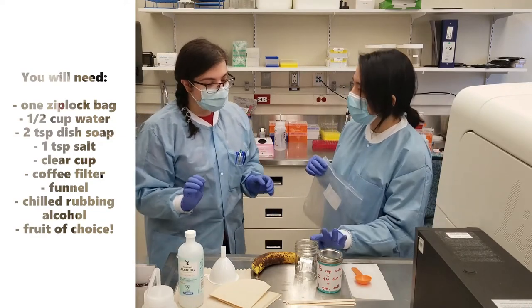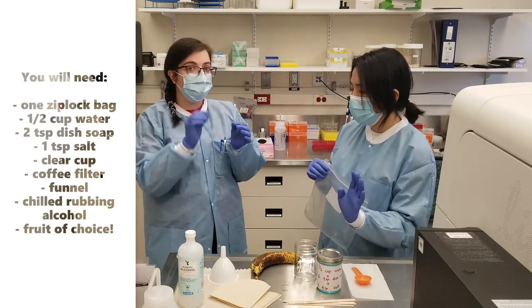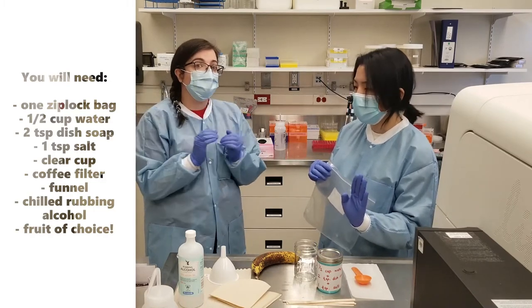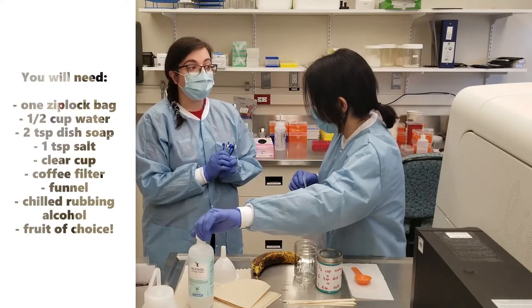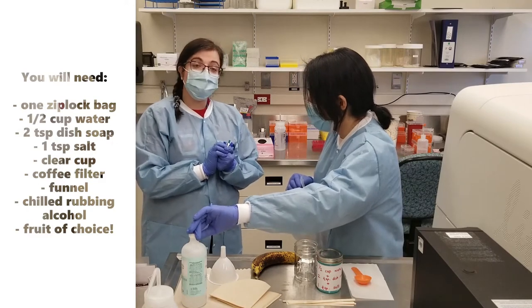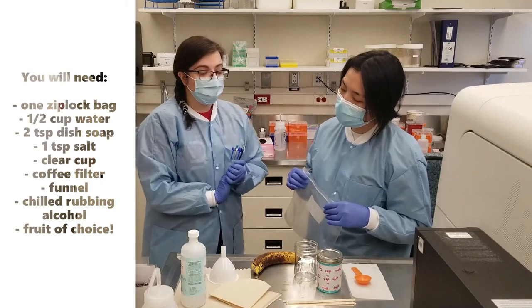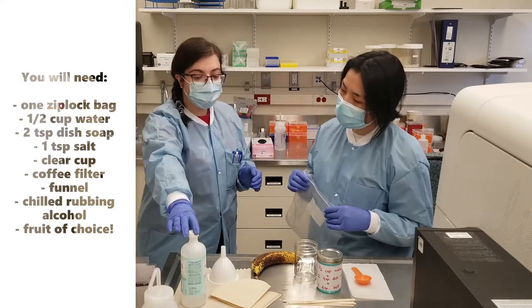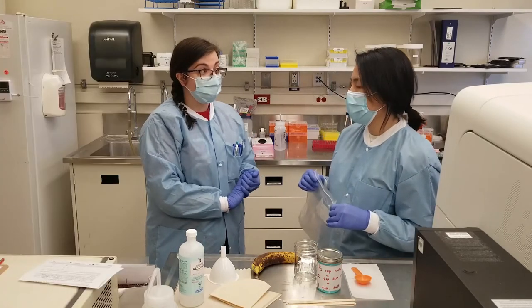So does it have to be glass? No, it does not — it can be plastic as long as you can see through it, so you can see your separated layers at the end of the extraction. But the alcohol has to be cold? It has to be cold — from the freezer cold. Before you start the extraction, this is the first thing you should put in the freezer, to get it nice and cold for your extraction procedure.